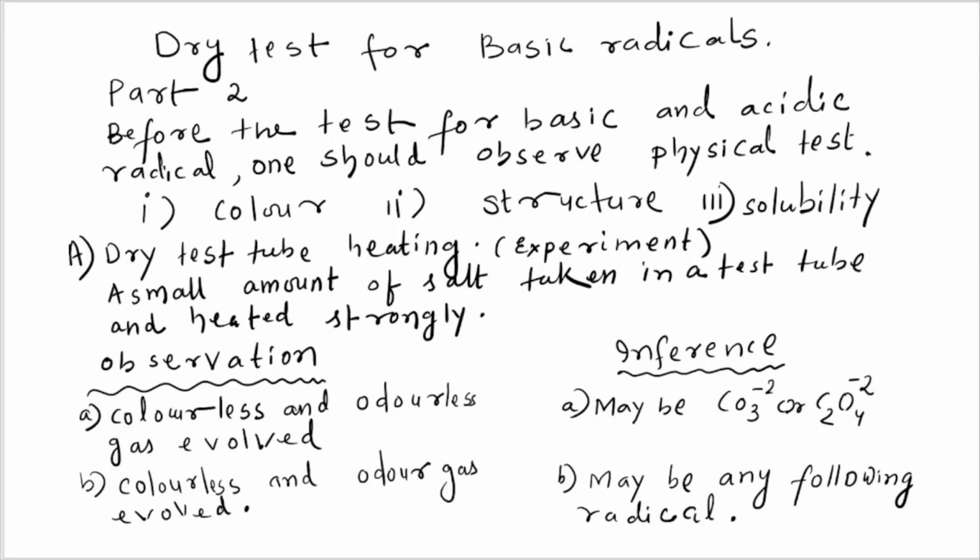Dry test tube heating. First you will see dry test tube heating, because this is part 2 where I will only explain the dry test. I told the names of the dry tests in the first video. The first one is dry test tube heating. In dry test tube heating, what to do? We will observe the color and odor, and also whether any gas is produced or not.